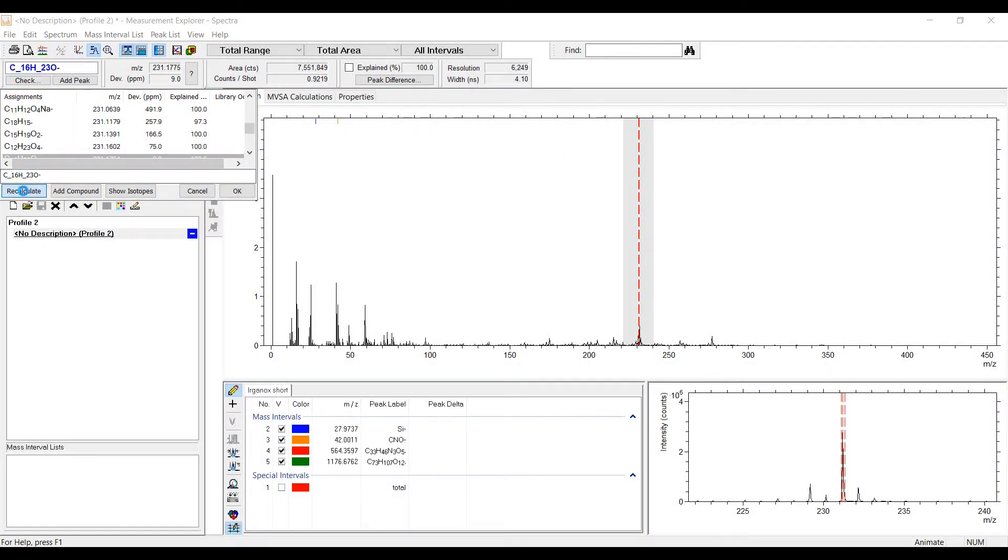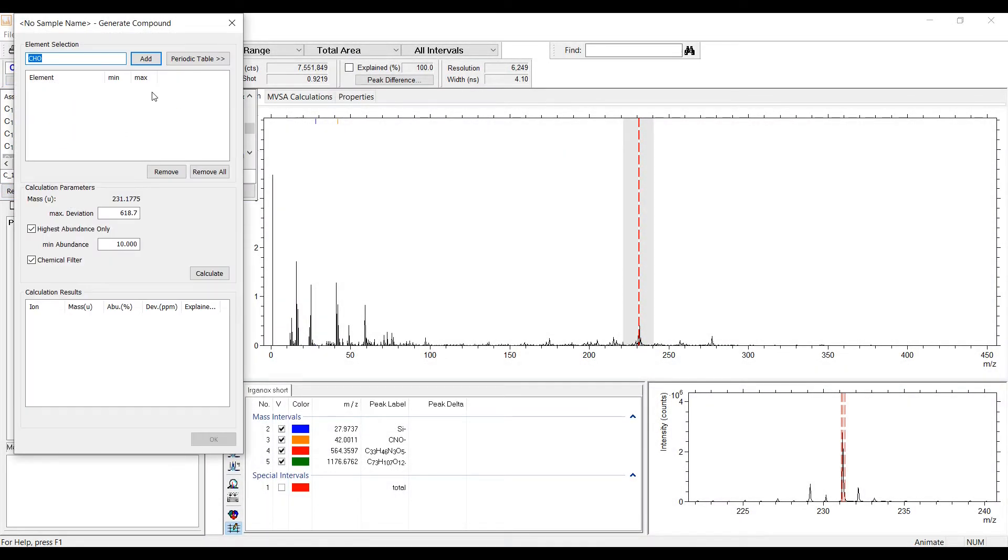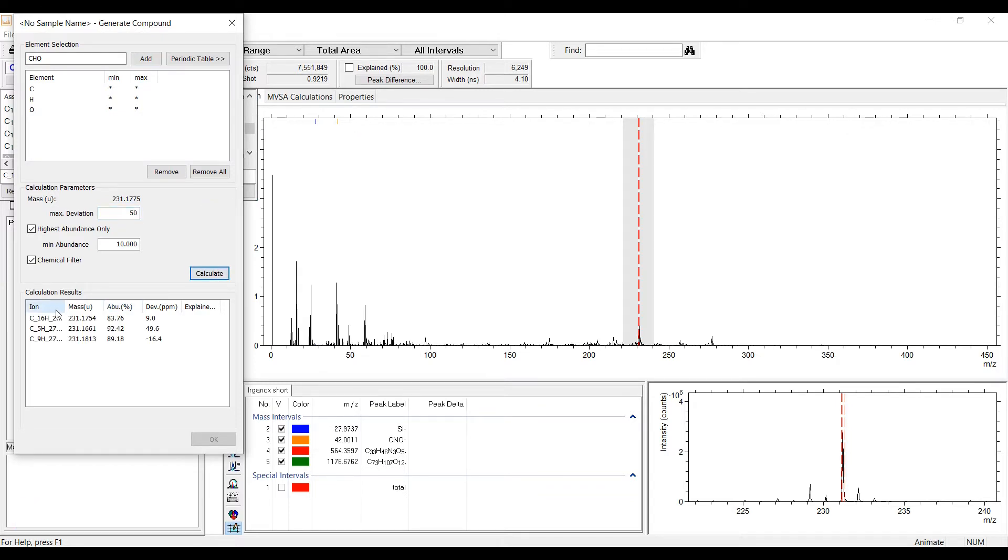The performance of the recalculate dialog was significantly improved. It is now up to 30 times faster when calculating possible assignments.